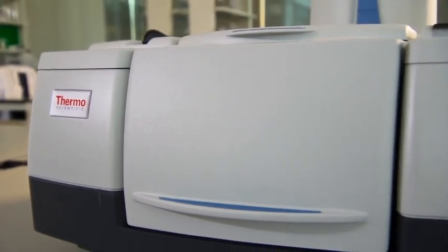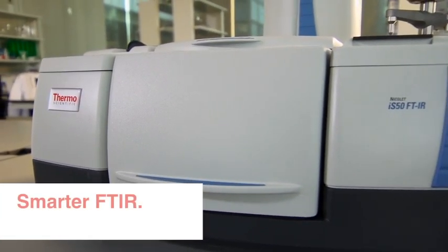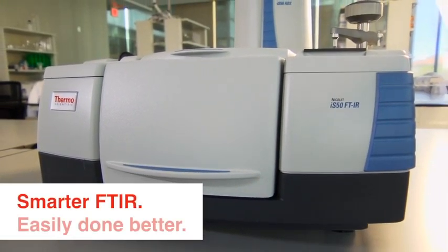The Nicolet IS-50 materials analysis workstation, smarter FTIR, easily done better. Learn more about the Nicolet IS-50 at thermofisher.com/is50, or about all Thermo Fisher scientific solutions in forensics at thermofisher.com/forensics.